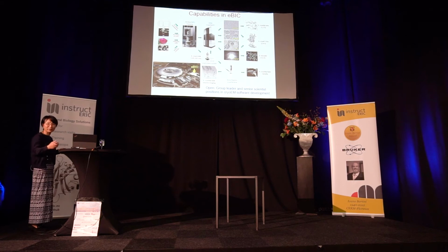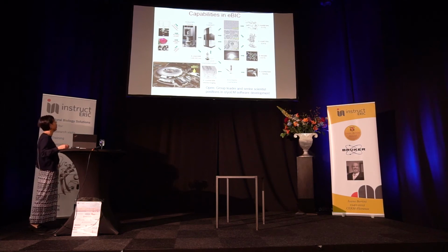I also want to mention that we are currently recruiting for a group leader and senior scientists for positions in cryoEM software development. In eBIC, we take all kinds of samples. We accept purified protein samples, purified virus preps, as well as cells grown on EM grids and microcrystals for microED. Yesterday's talk was about protein microcrystals; you can talk to us and try microelectron diffraction that we established in eBIC.